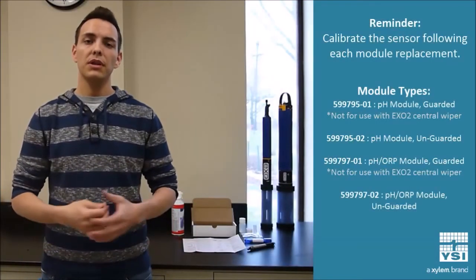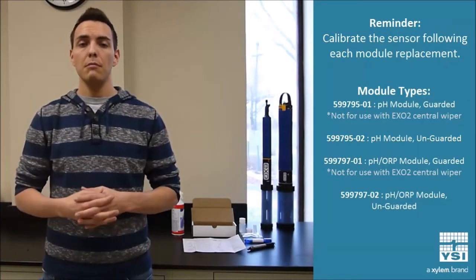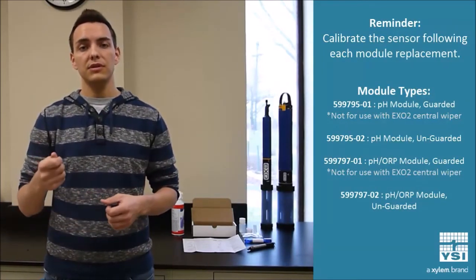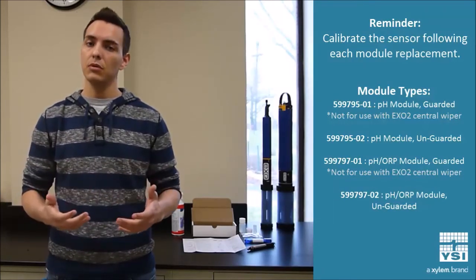So that was the process for replacing a pH module on an Exo pH sensor. Make sure, though, that before you take this new sensor out into the field to collect data, that you calibrate it in desktop core or the handheld.